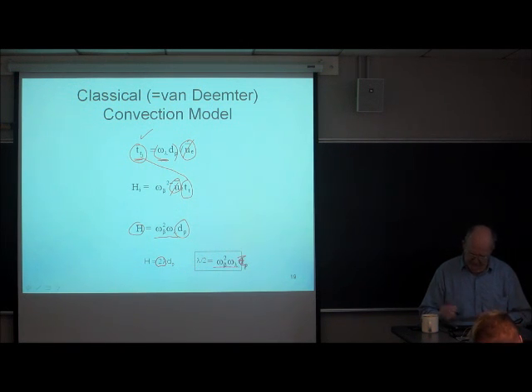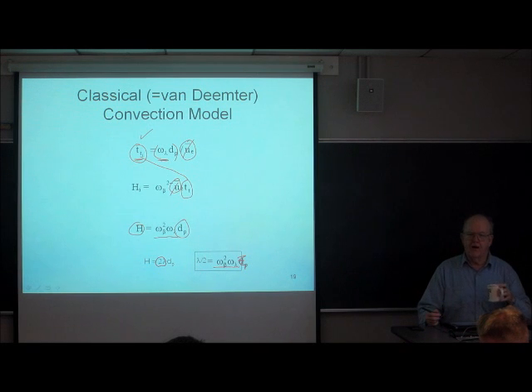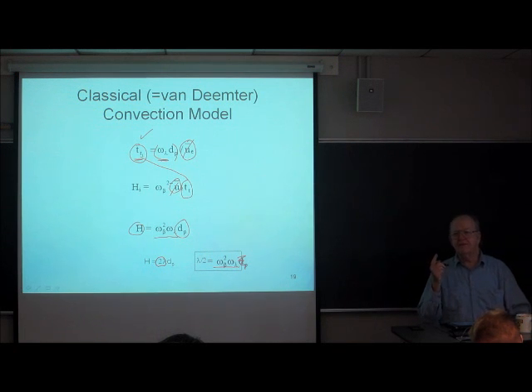Lambda over 2 is this bunch of constants according to the Giddings approach. But the point is that H is simply proportional to the first power of the particle diameter for the flow-induced or eddy dispersion process, if Van Deemter's assumption that transport is controlled only by convection is true.